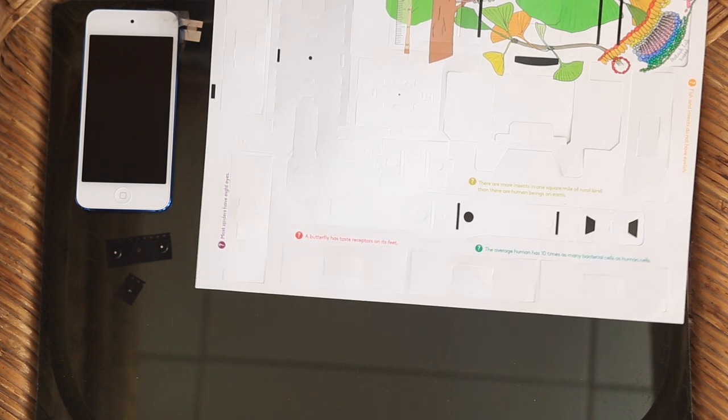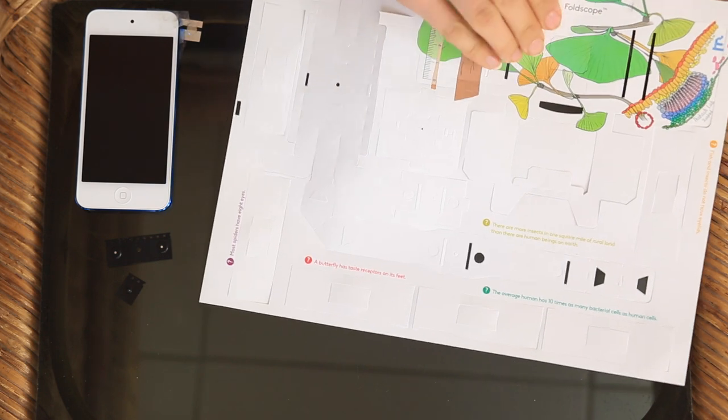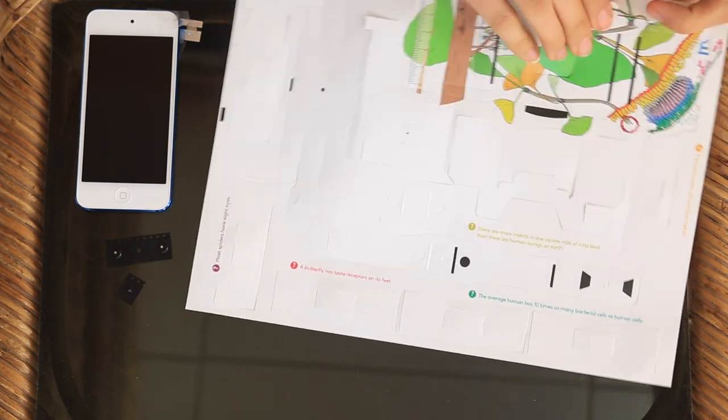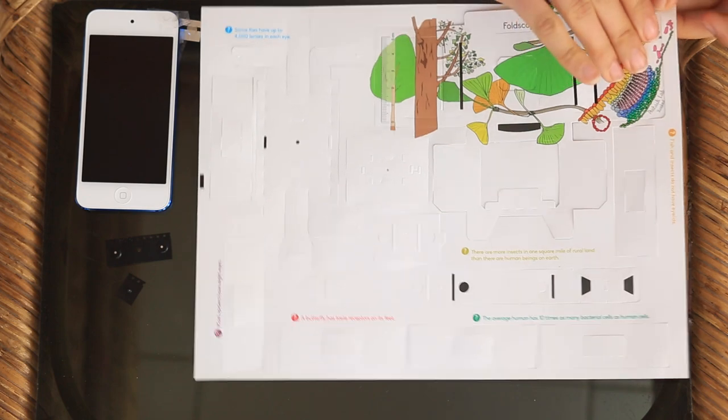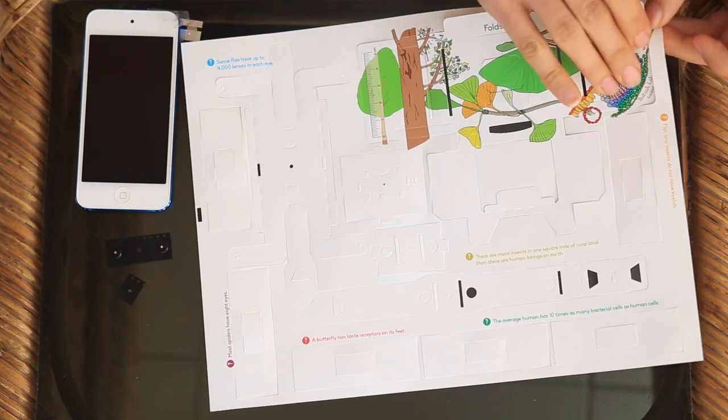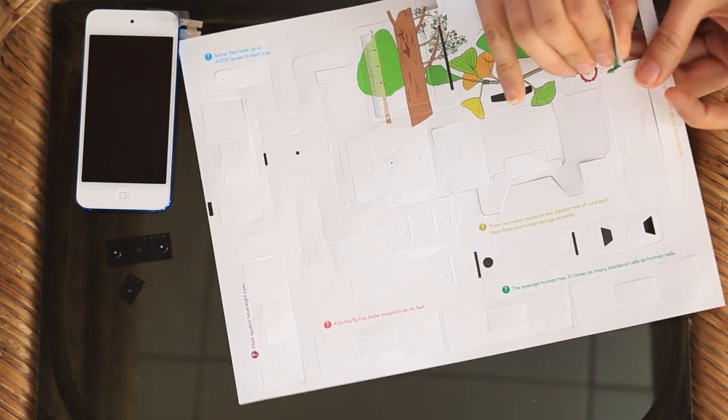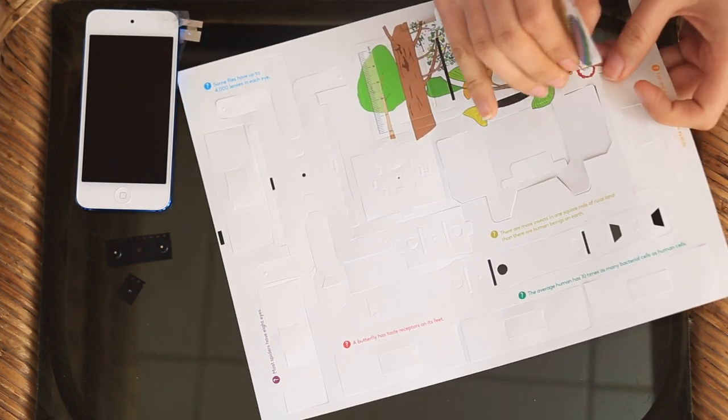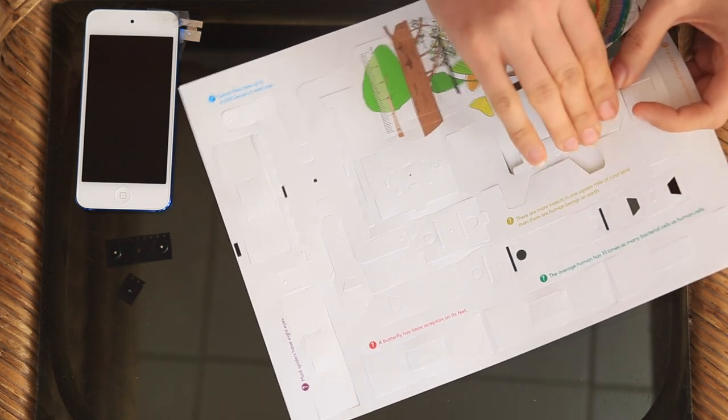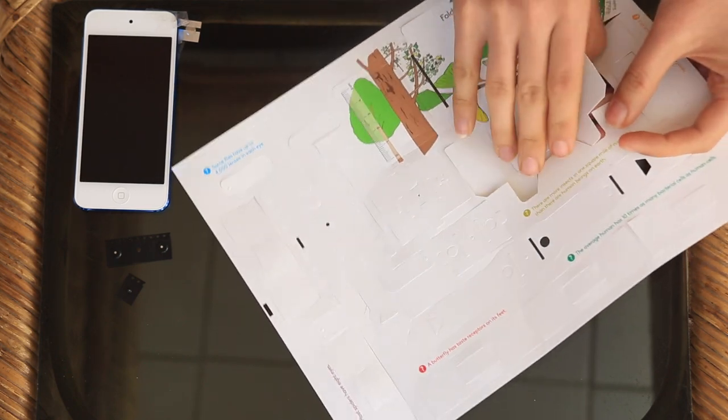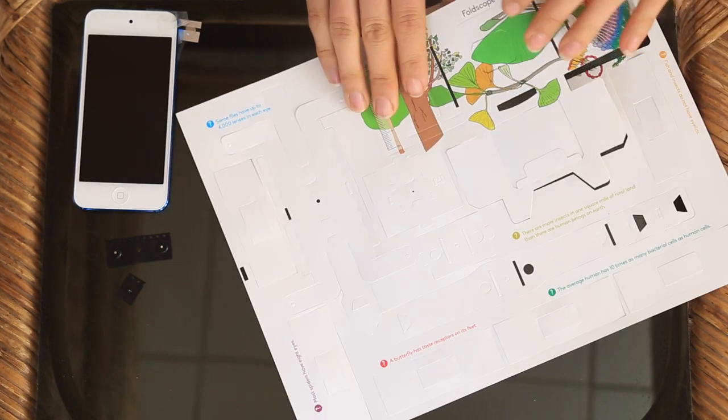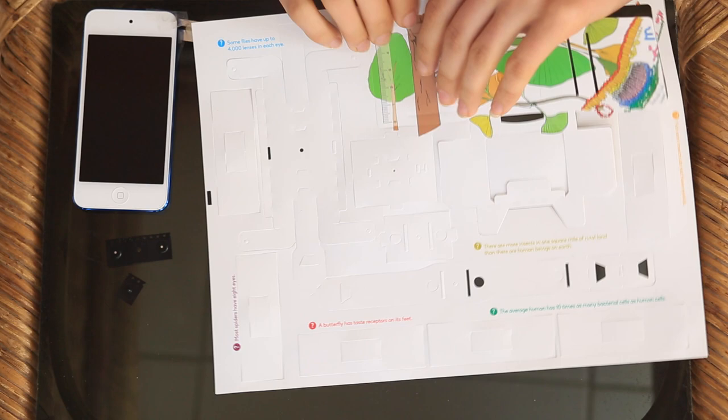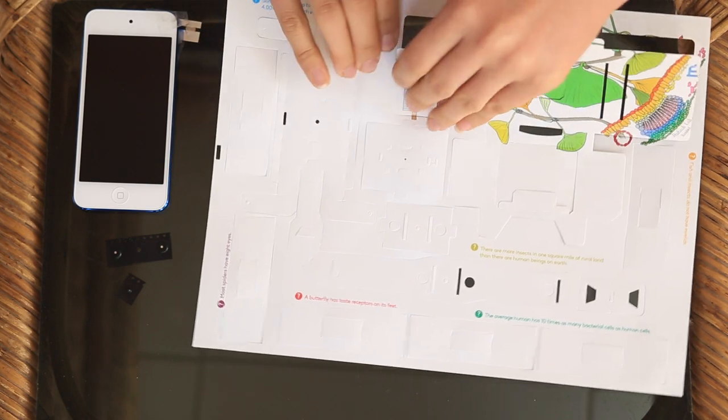The first thing you do is you punch out all the different pieces of the Foldscope. So this is the first part, this is your panning stage, and then you have your illumination stage. This is also another part that we call the butterfly.